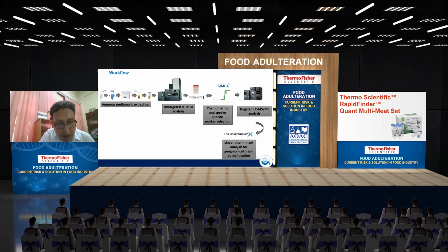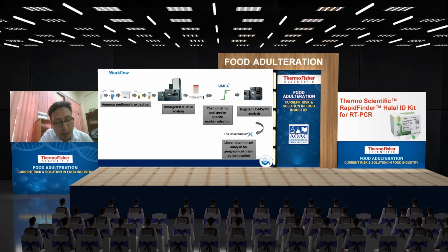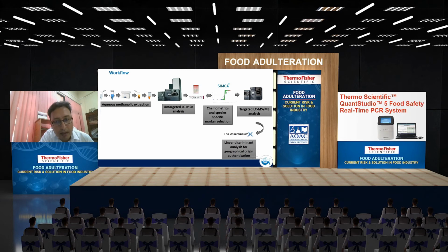So the problem with LC-HRMS based authentication methods is that mass spectrometry is not as repeatable as spectroscopic methods like NMR, FTIR, NIR, or Raman.